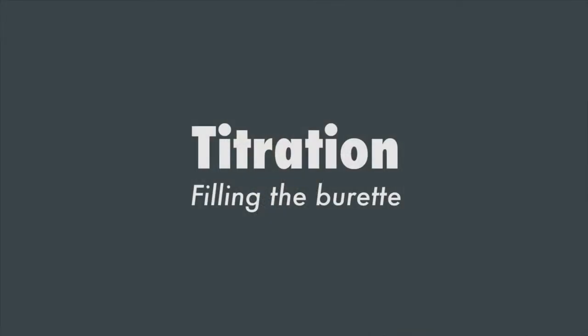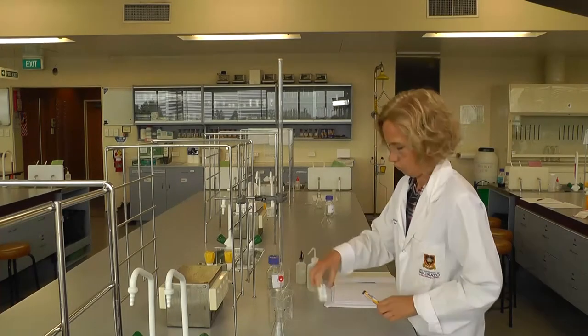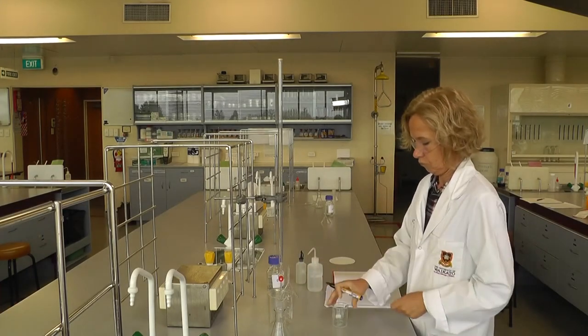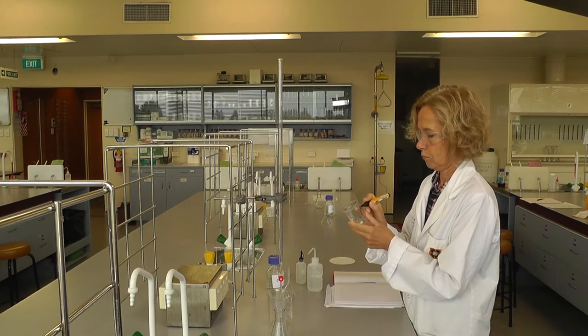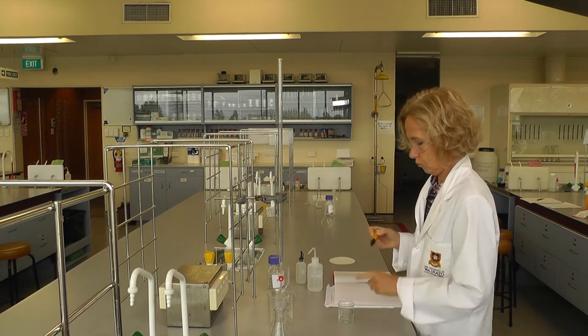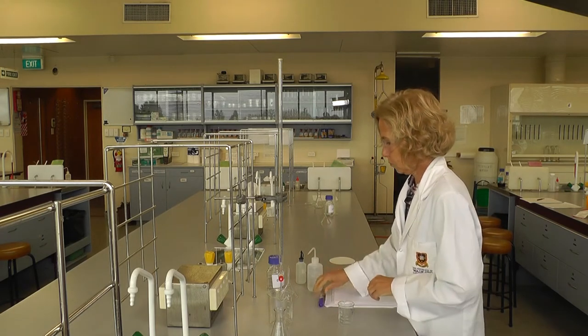In this video we're going to show you how to rinse, fill and read a burette. Titrations use a lot of glassware and equipment, so it's very important that your work area is clean and well organized. Flasks and beakers should be labeled to prevent mistakes.